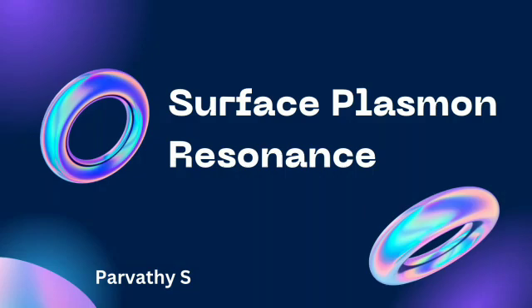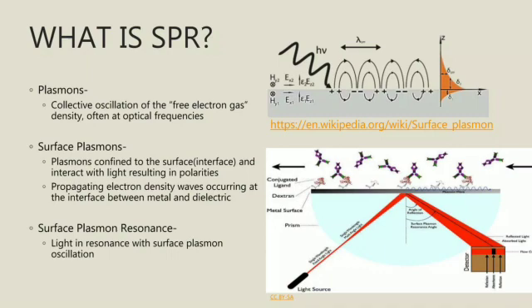Surface plasmon resonance. So, what is surface plasmon resonance?